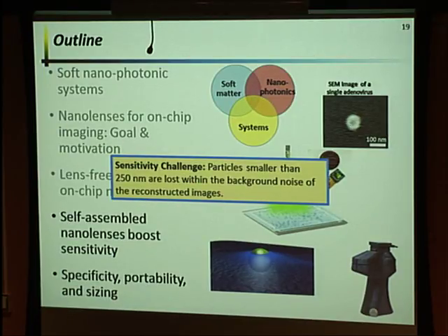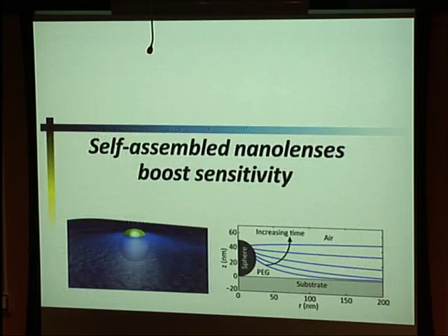So typical viruses are in the size range of about 25 nanometers at the small side up to maybe 200, 300 nanometers at the large size, that sort of range. So if we can get down below this, we can start to get into the realm of viruses.